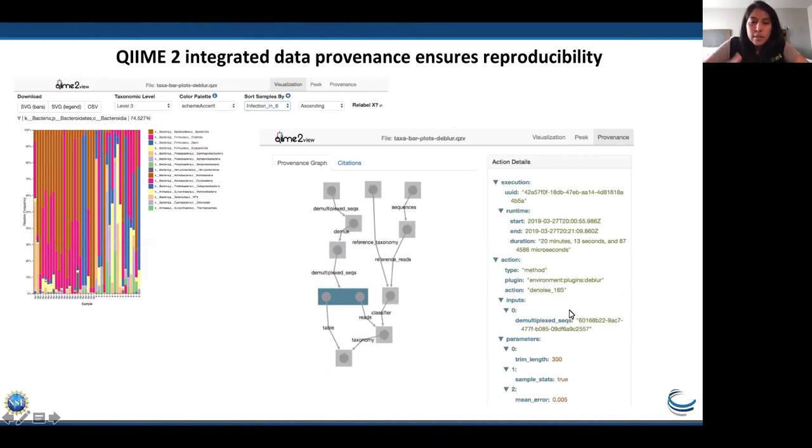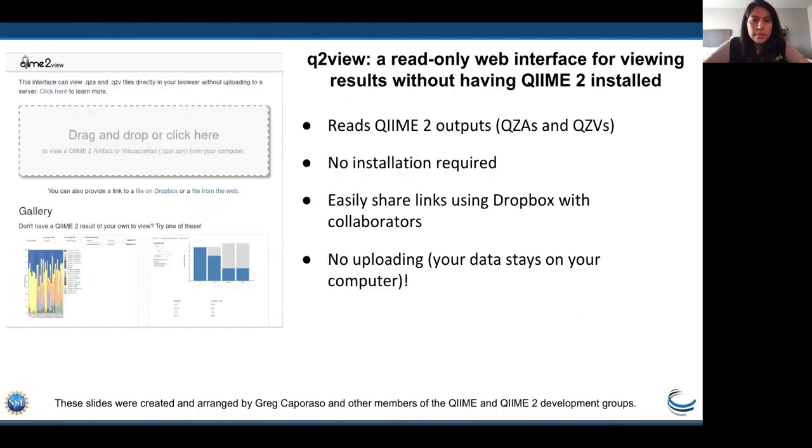So this will make a little bit more sense once we go into it, but it's really exciting that you can also list the parameters, which is helpful because this QZV file, it's a visualization file. It has all of this put together through this zipped, I guess, QIIME file format. So this is really exciting that I think the individuals for QIIME have expanded on.